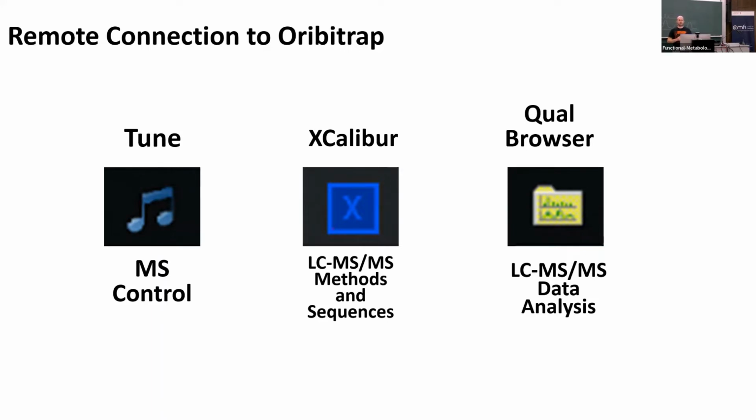I think they are trying to replace it now with Freestyle. So if you recently bought an instrument, Qual Browser might still be somewhere hidden, but they encourage everybody to use Freestyle. I like Qual Browser better, but I guess that's your choice.